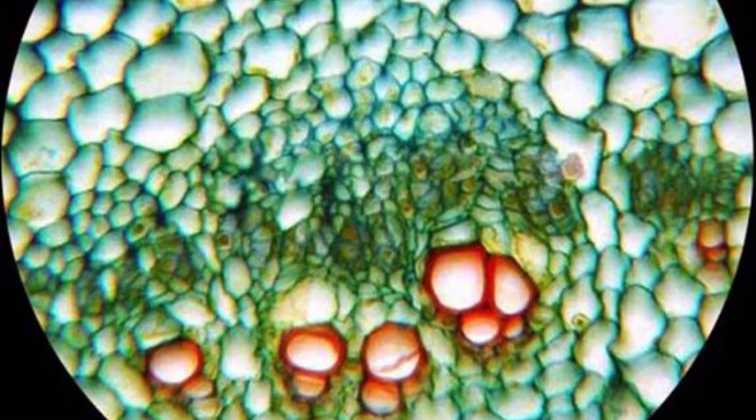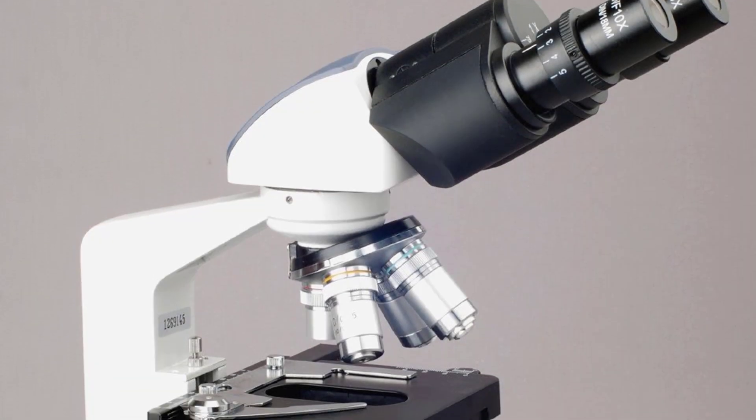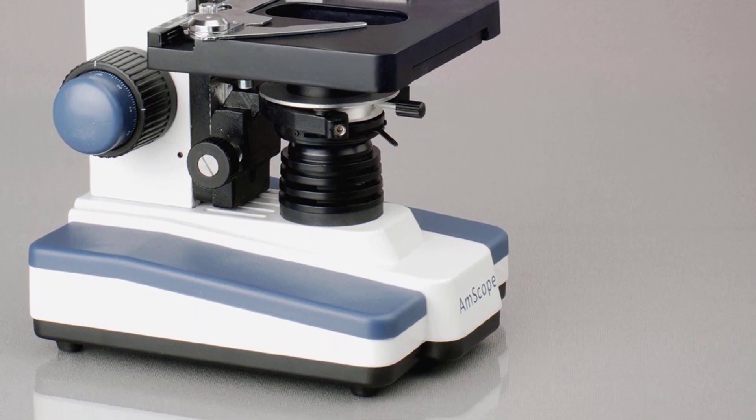It's equipped with a binocular head that is inclined and swivels, a variable magnification from the objective and ocular lenses, and fully brightness-adjustable LED lighting.